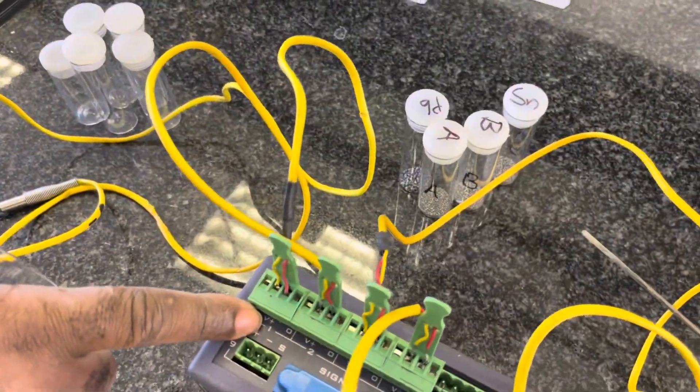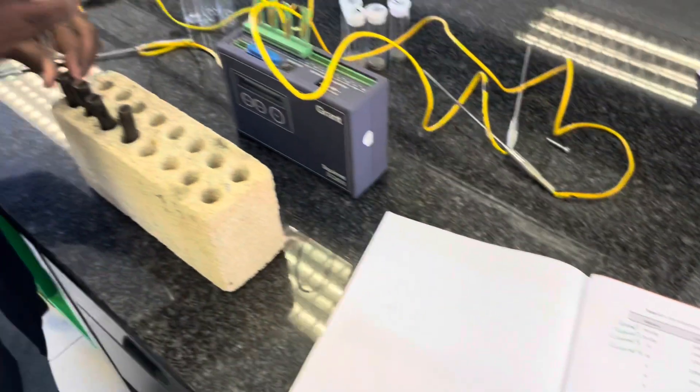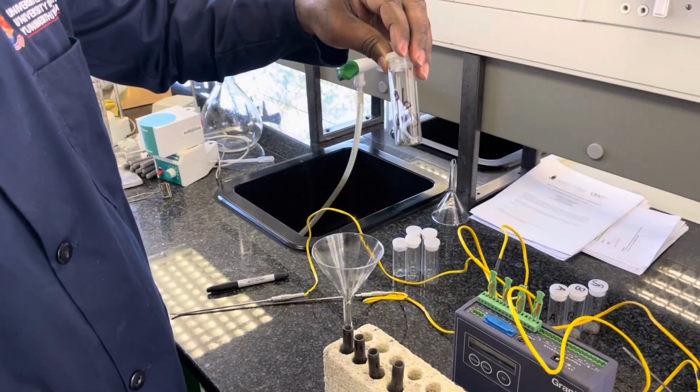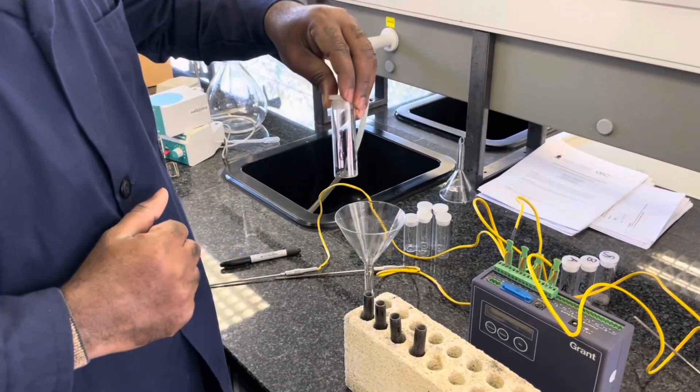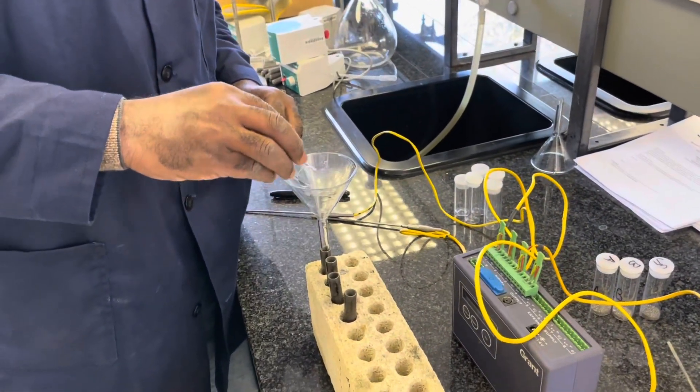Now label your test tubes one, two, three, four, as well as your mixtures one, two, three, four, which corresponds to a specific channel on the data logger, and transfer that specific mixture or pure compound to the corresponding test tube.